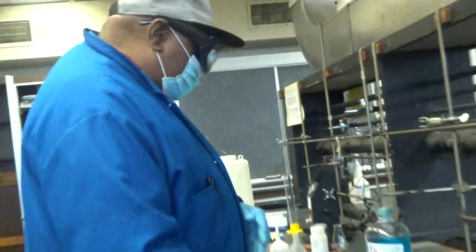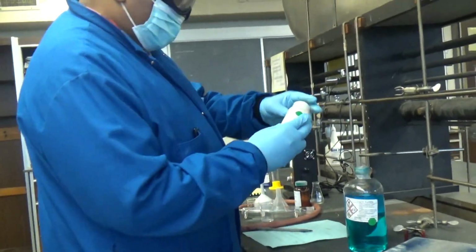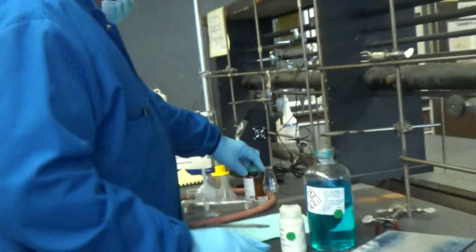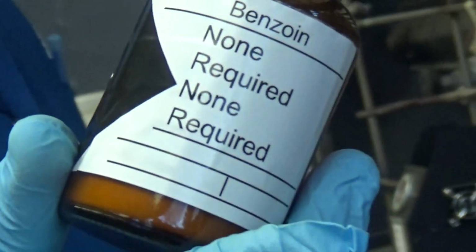Cupric means copper, oxidation number 2, so it's copper(II) acetate. You need ammonium nitrate. We need benzoin, that's the starting material.